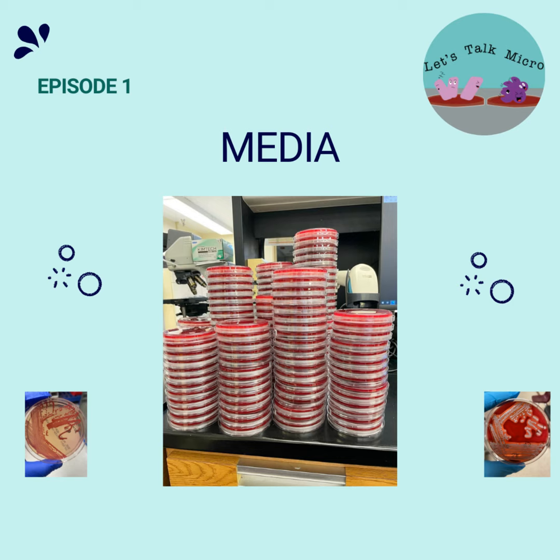So the doctor orders a culture, and like the word says, we are cultivating the sample. We are trying to see if something grows out of it. And in this media, or agar, there are nutrients that the organisms need to grow. Just like us, we need food, so they need food also. They need some nutrients. And there are several types of media, right? So on this podcast, I am focusing on media for bacterial cultures.